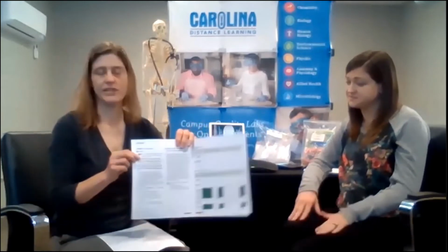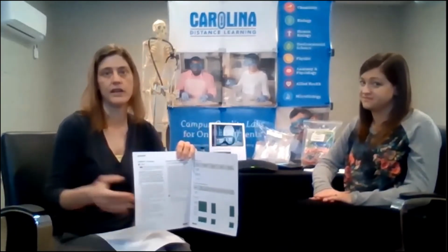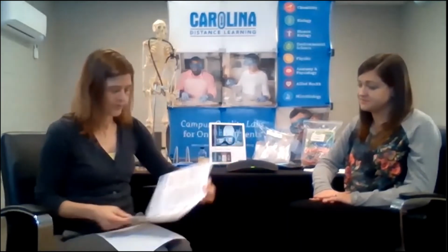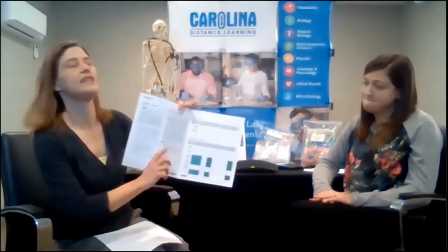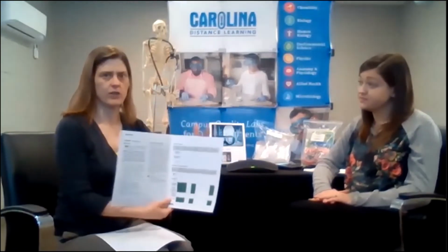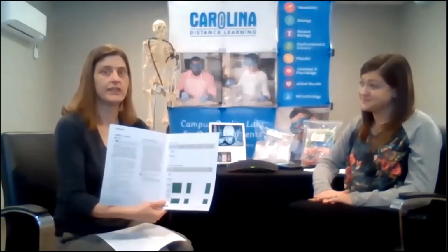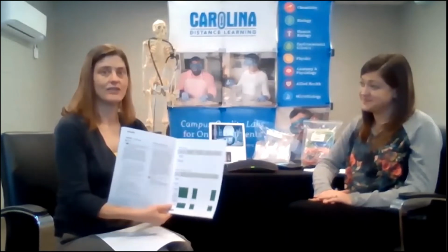But in this, once they take the picture, they can put it into the Word document that's a lab report template that I post for them to use. Note, we also have detailed instructions of how to dispose of everything, especially when you're looking at a microbiology lab. Students want to know, how do I dispose of these cultures safely? We've got that taken care of. That's something we have taken into account.